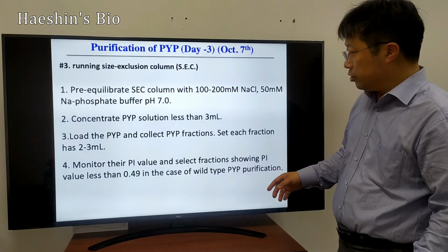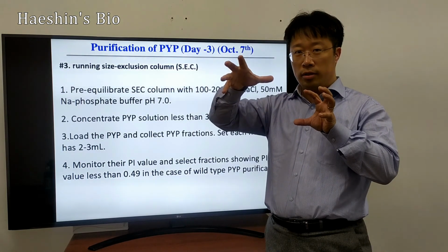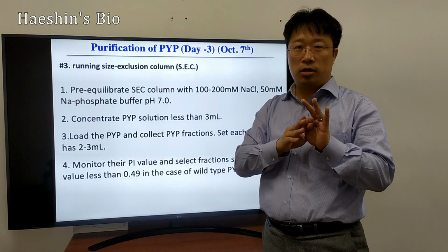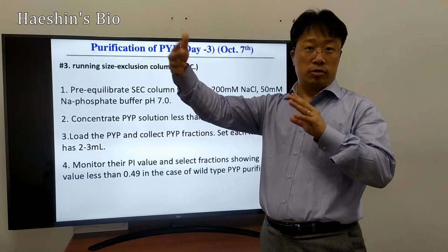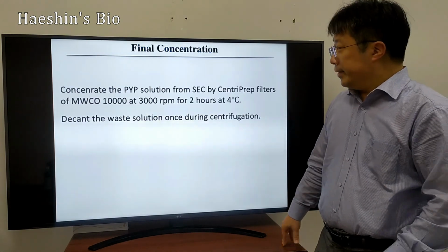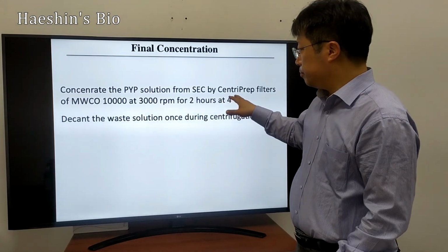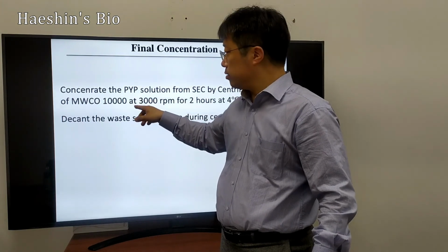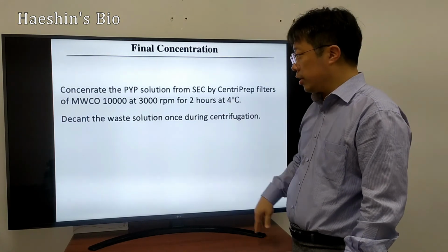Anyway, in all of this procedure, anything that has columns dilutes the proteins: the nickel NTA column, the ion exchange column, and the size exclusion column. You dilute 100 times, 10 times, 100 times like this, so you end up with very large volumes. So after this column step, you have to concentrate again using a molecular weight cutoff membrane. PYP is about 14 kilodaltons, so you use a smaller membrane and concentrate again.